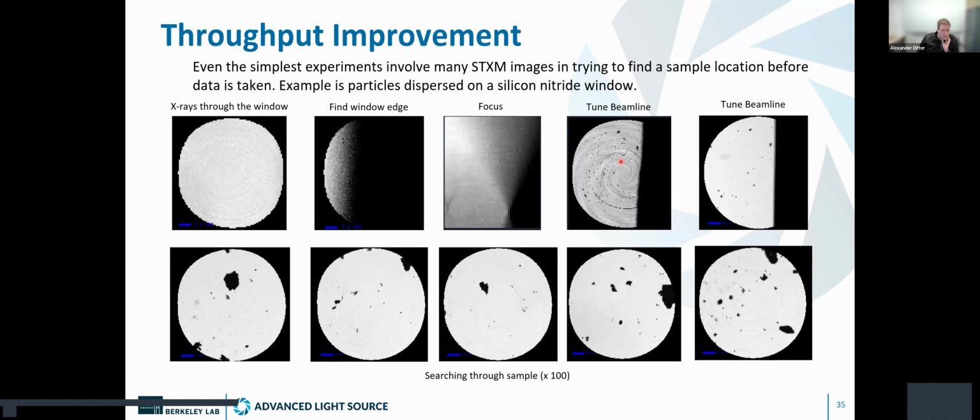If I were better at math, I might have a good answer for you. There's kind of a mechanical answer, which is that our friends at the Molecular Foundry have done a method where they have this overlapping spiral scan. So they essentially have one spiral scan and then they rotate it slightly and do it again.